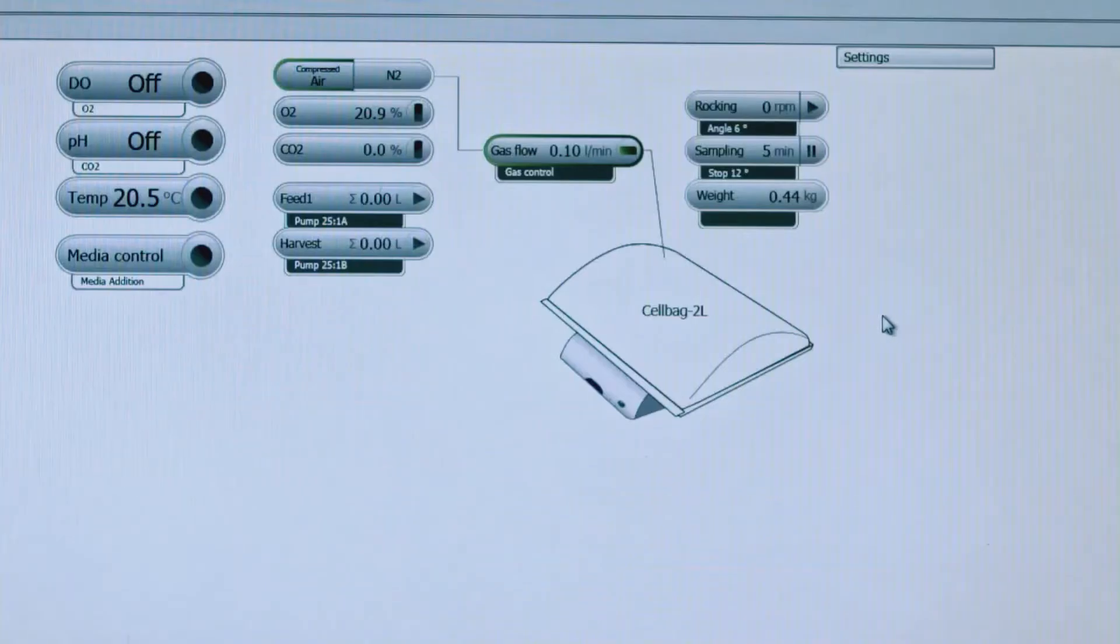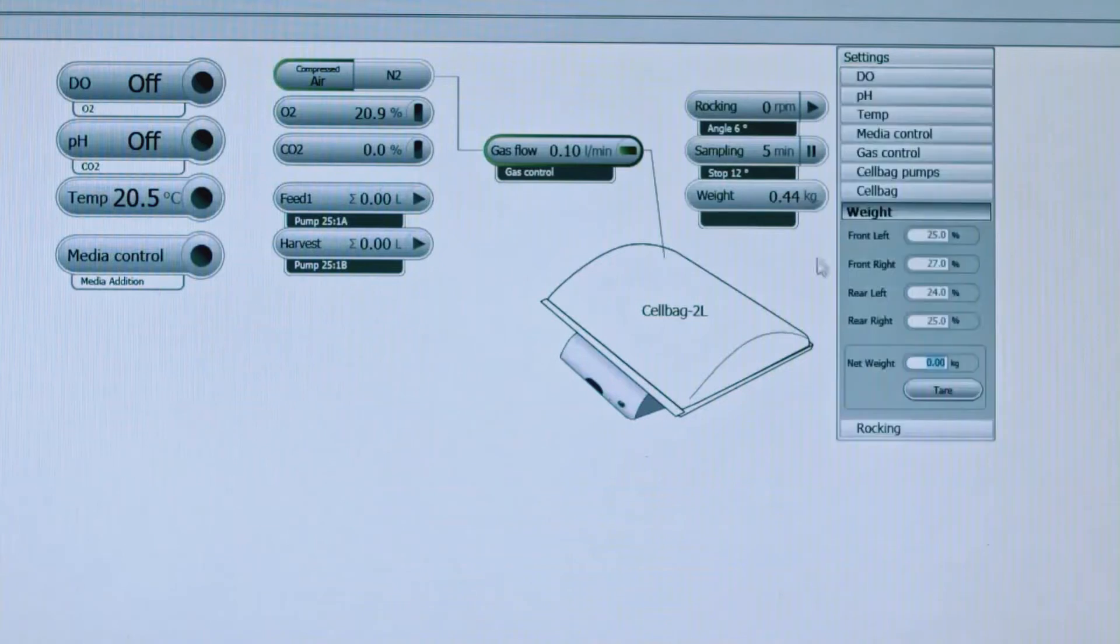Before adding any media to the bag, you'll click on the weight button and tare the weight so the net weight equals zero. Once that shows zero here, you can click media control.